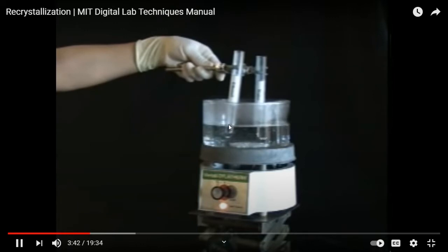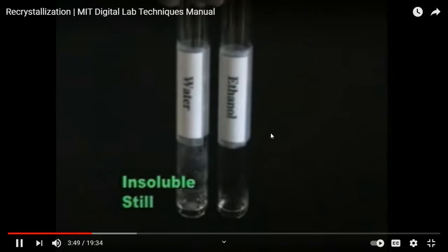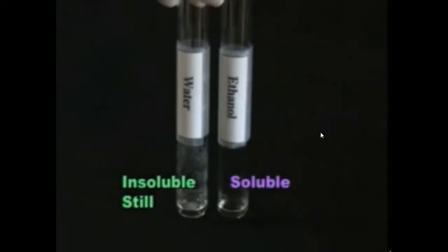Swirl the tube and make note of whether or not the compound dissolves. After heating, naphthalene is still insoluble in water. You see the bottom? You have still solid. Whether it's less than before or not, it's not completely soluble. But it is now soluble in hot ethanol.